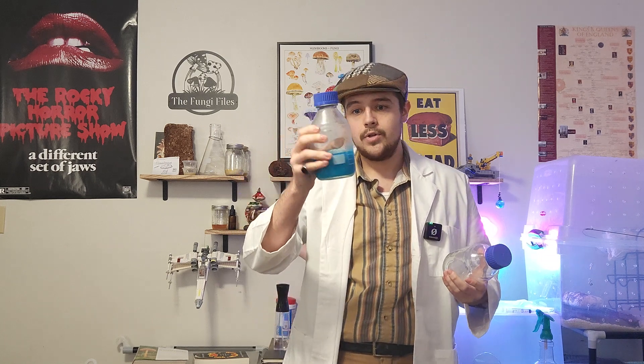Now moving on to these glass media bottles — reagent bottles. They're about 17 dollars for the two of them, but you can see I've already used them for agar work, which is super nice for sterilizing. They're safe to use in an instant pot or pressure cooker and they can be stored in the fridge to keep my extra agar ready to use.